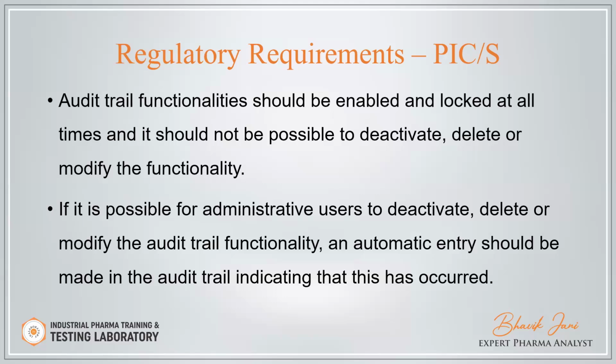If it is possible for an administrator user to deactivate, delete, or modify the audit trail functionality, automatic entries should be made in the audit trail indicating that this has occurred. If the administrator has rights to deactivate the audit trail, then the audit trail should capture all the activity of deactivating and enabling or disabling the audit trail. This activity should be captured by the audit trail.